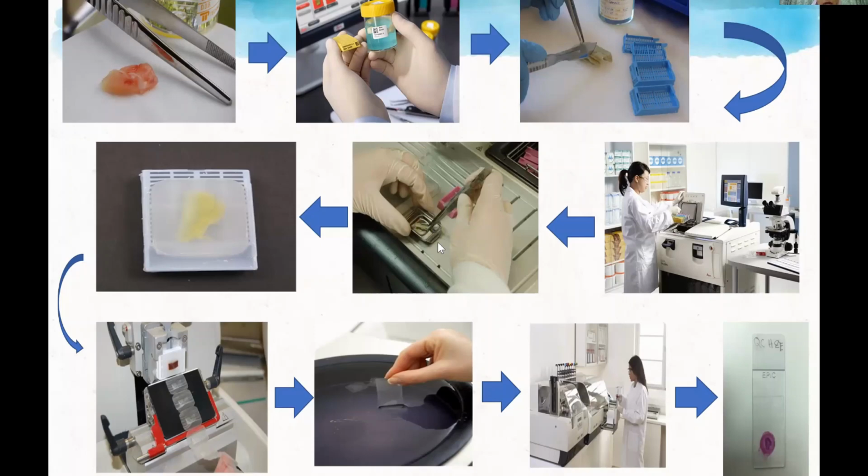This one you call a mold, and then we pour the paraffin. So make it like this. So here it is easy for our staff to slice or cut the sections into thinner sections. Then it is put on the glass slide here, and after that, stain. Then we get the slide, and we can make the histologic analysis.